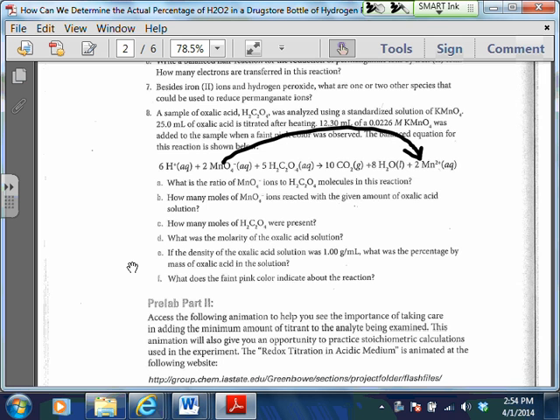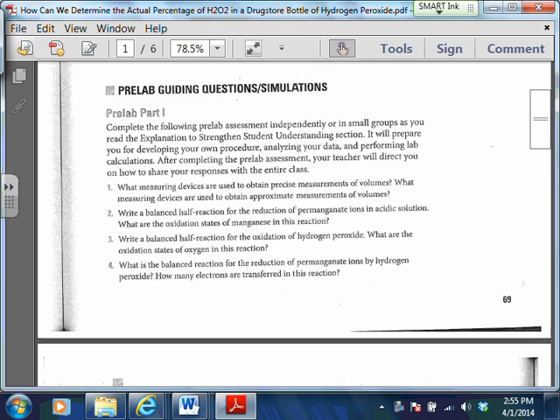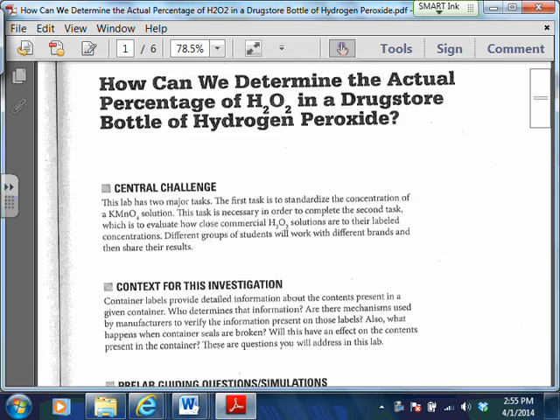It's going to get faint pink first, right? If you start to add any more of this after this is all reacted, then it's going to start to change more of a purple-ish color, because then you're just adding excess MnO4 minus into the solution. Does that make sense? They did not make that very clear, unless I'm missing it somewhere else in the lab, but at least I'm able to tell you this.